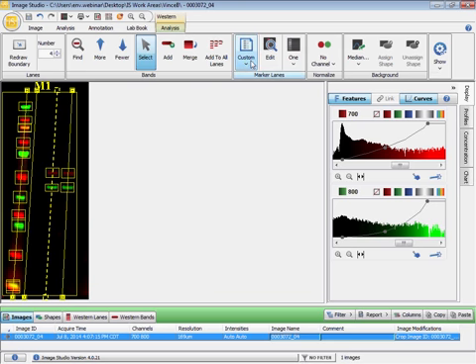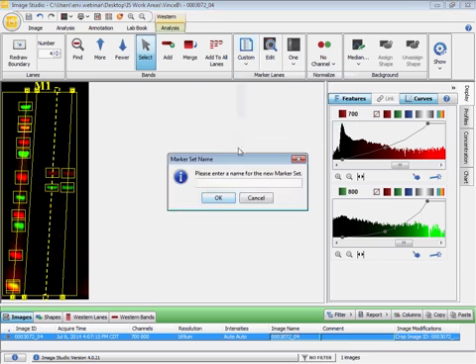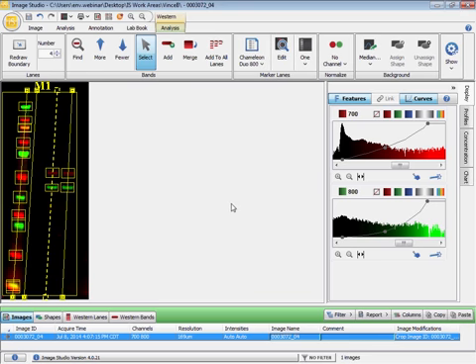And we'll name this marker lane set as before. Click on the pull-down menu and Save Marker Lane Set. Let's name this set Chameleon Duo 800 and click OK to confirm. If you are using the Chameleon kit to size proteins, you will use the Chameleon 700 Duo and the Chameleon 800 Duo marker sets to size bands in the appropriate channels as needed.